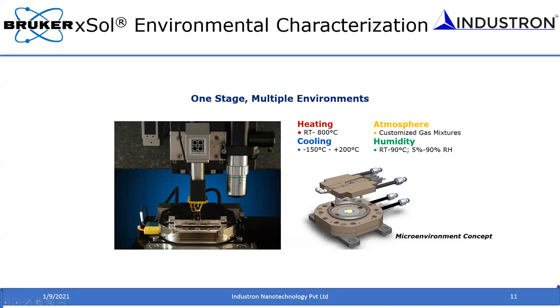And in between these two heaters, you create a gap, basically a small chamber, through this gasket. In that chamber, you can pass a shield gas to have whatever gaseous atmosphere you want. Or you can have humid air to have a humid presence. Or you can pass cold nitrogen to change the temperature to cryogenic temperature. So you can have an environment where you want to do the test, and then you can do the test.